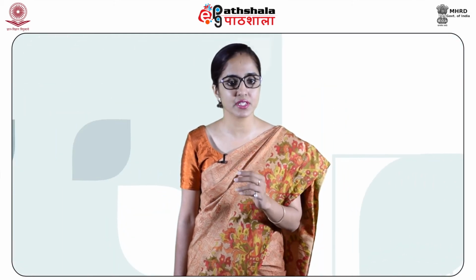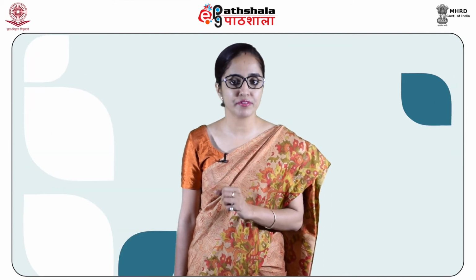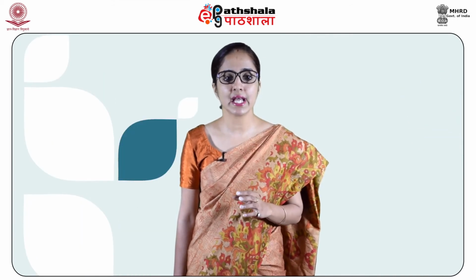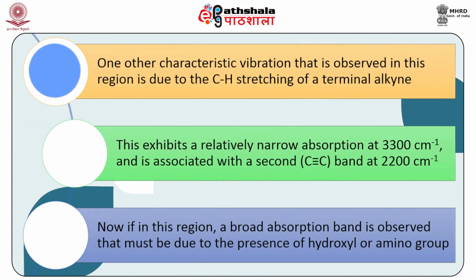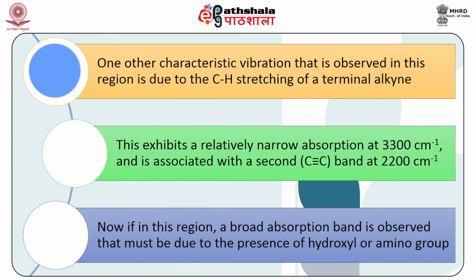Let us consider the first region, that is absorption in the region of 3650 to 3250 cm⁻¹. Hydroxy or amino groups mainly appear in this region, both giving rise to very characteristic band profiles. The position, intensity and shape of the band indicate whether the group is free or hydrogen bonded. One other characteristic vibration that is observed in this region is due to the CH stretching of a terminal alkyne.